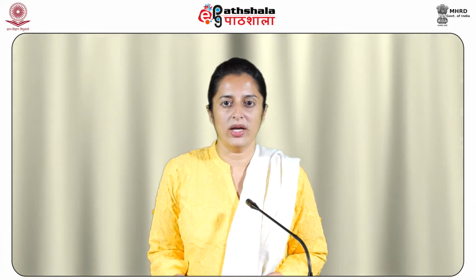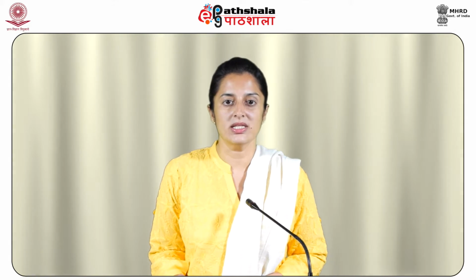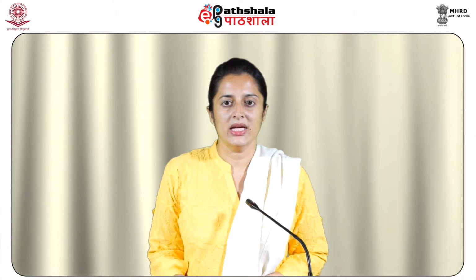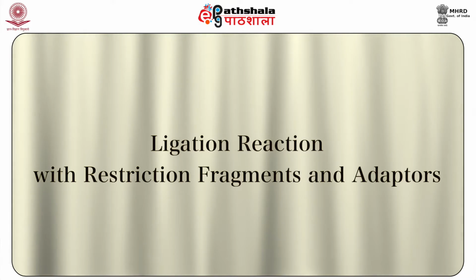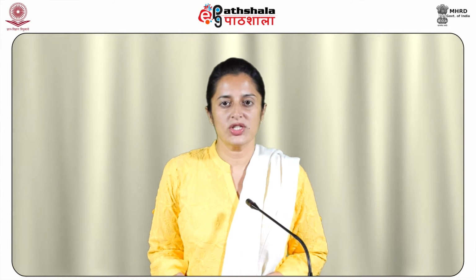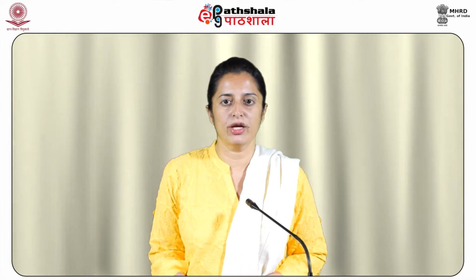MseI and EcoRI generate DNA fragments with 5' overhangs, that is 5' TA 3' and 5' AATT 3' respectively, that are distinct from each other and are non-complementary. Step 2. Ligation reaction with restriction fragments and adapters. In order to make use of the fragments of genomic DNA generated by MseI and EcoRI digestion, researchers needed a method that would allow them to generate a unique type of DNA fingerprint.